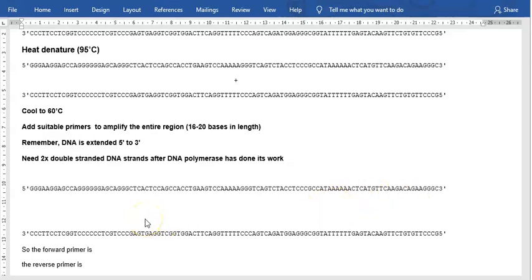So you've got to put your primers there. Let's say they're 16 bases or nucleotides in length. What I want you to do is type your primer sequence here so that that sequence matches the DNA here. Okay, and remember, A's bind with T's, C's bind with G's.